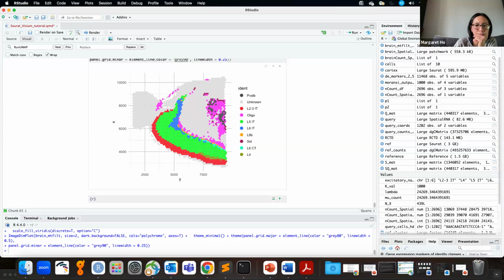Does Seurat work for expression data such as protein abundance or only count data? I don't have any experience with protein. I'm not sure, I'd have to do some research on that. I mean, it's count data for transcripts. I guess Seurat can maybe deal with protein data, but I'm not really sure. Probably not. There are other packages available for RCTD.